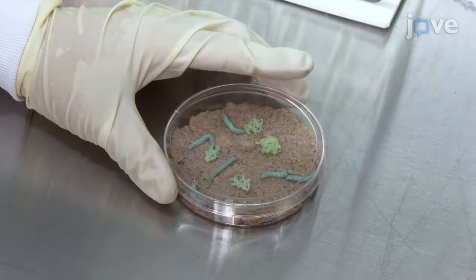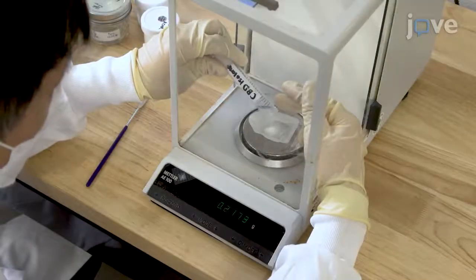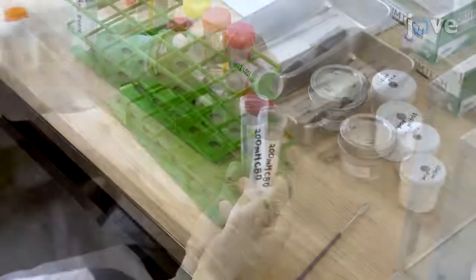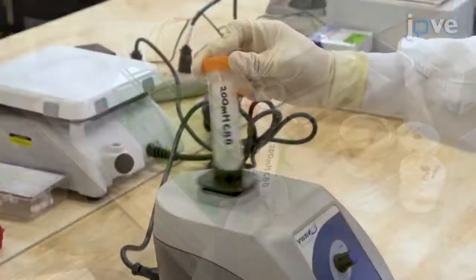Allow the eggs to hatch for 1 to 3 days inside the insect rearing chamber. To prepare a 200-millimolar cannabidiol stock solution, add 1.26 grams of greater than 98% purity cannabidiol isolate and 20 milliliters of ethanol or 100% medium-chain triglyceride oil.